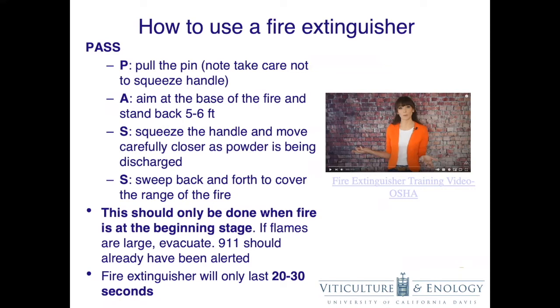This should only be done when the fire is at the beginning stage. If flames are large, evacuate and call 911. 911 should have already been alerted once the fire started. Fire extinguishers only last 20 to 30 seconds. Here's also a link of how to properly use a fire extinguisher. This training video is a great video. For the sake of time, I will not play it now, but I highly recommend watching it for those who are interested.